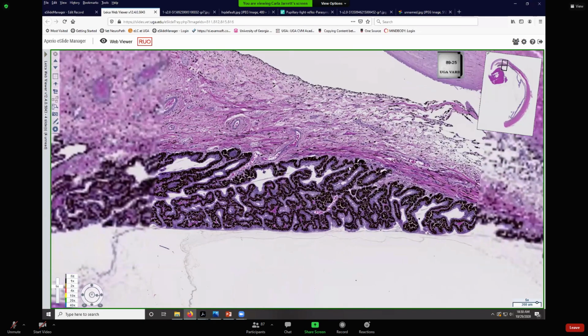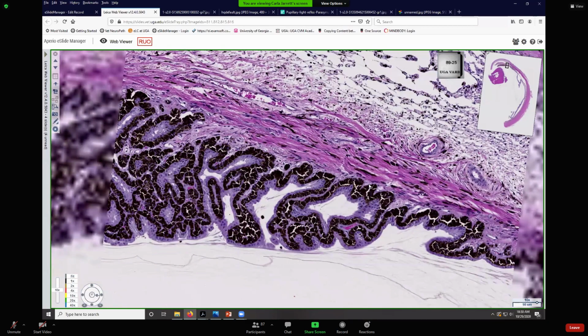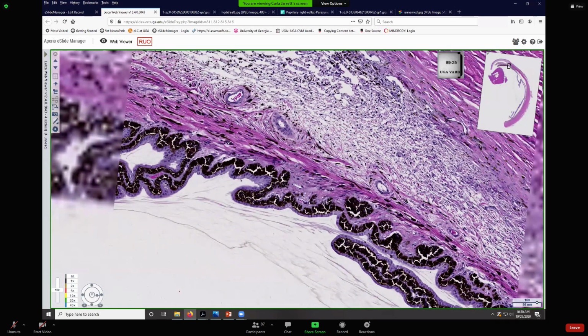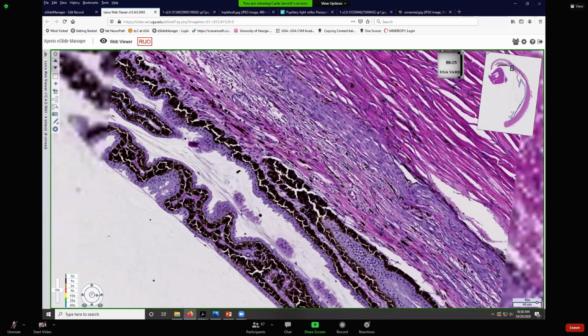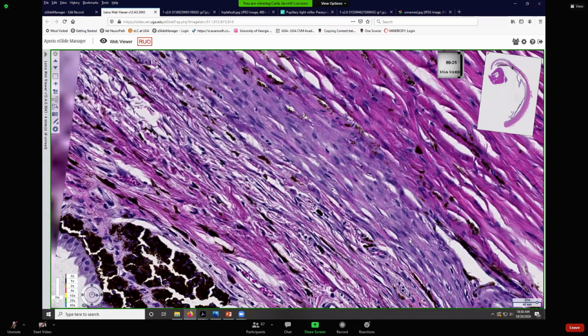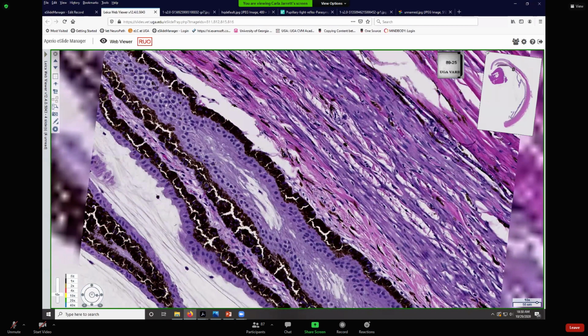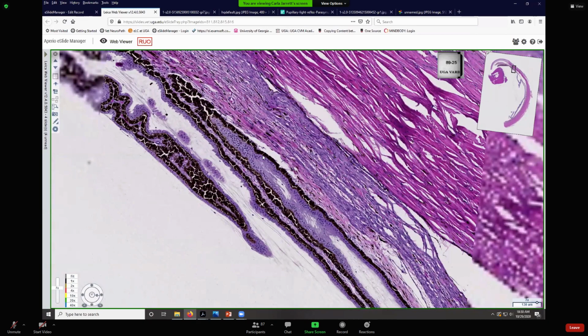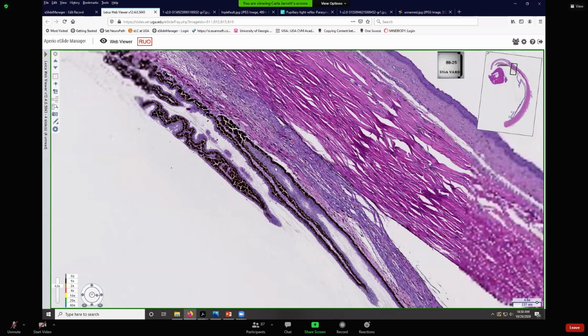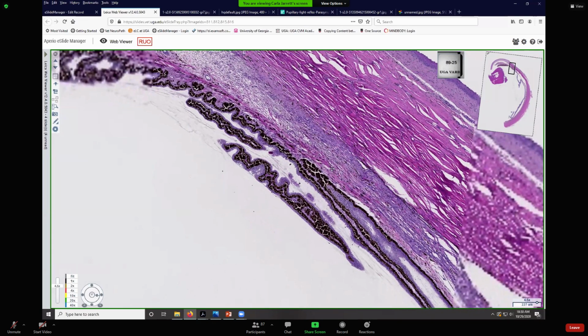But if the ciliary muscle contracts, where's our muscle? Come here, muscle. Here it is. If this ciliary muscle right here contracts, it will mound up because it's in this meridional arrangement. So if all these fibers contract, they'll thicken, round up, or form a hump here in the flat part of the ciliary body, the pars plana.